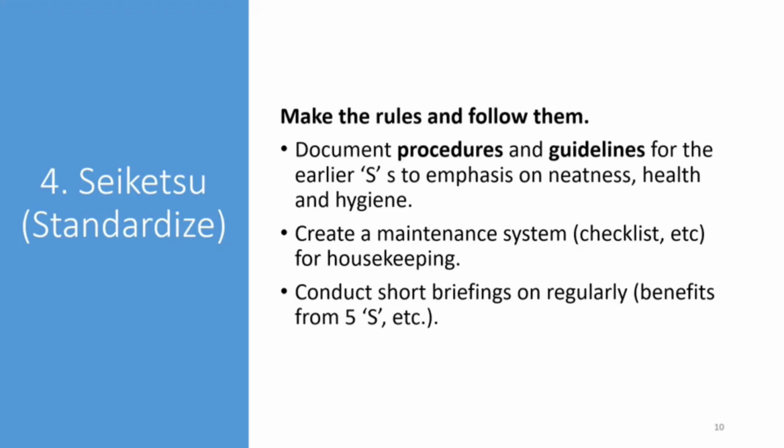The fourth step, Seiketsu, is basically to standardize the achievements from the earlier three steps. It involves documenting the procedures and guidelines for the earlier S. And short briefings could be done regularly to remind staff about following the 5S system.